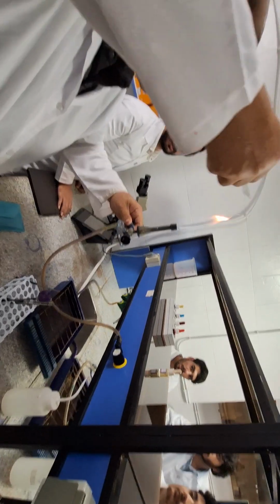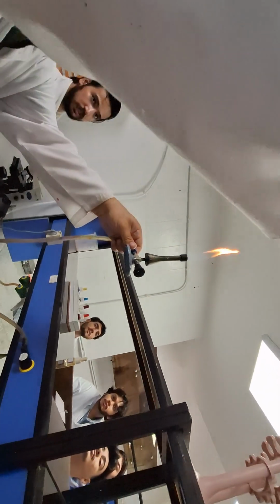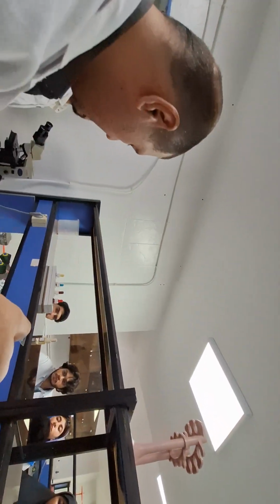After air drying, for heat fixation, move your slide 3 times over the top of the flame. 1, 2, 3. That is enough. Too much heating affects the quality of your staining and may change gram positive to gram negative.